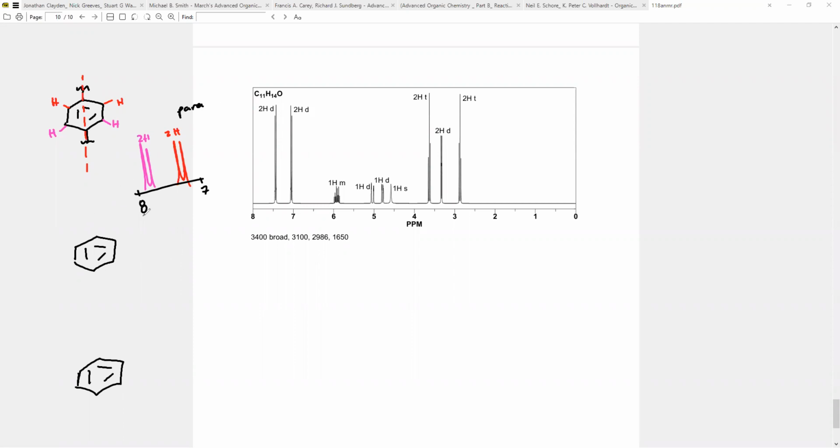Cool. Then let's say we shift the alkyl chain over by 1. What do we see now? Kind of like in the 3 H's, we see an H flanked by 2 groups, and whenever that happens, remember, we get a singlet. So we'll definitely get a 1H singlet. We also have these 3 H's coupling each other, so this one will couple with this one. Maybe we see a doublet of doublets again, a doublet and a doublet.